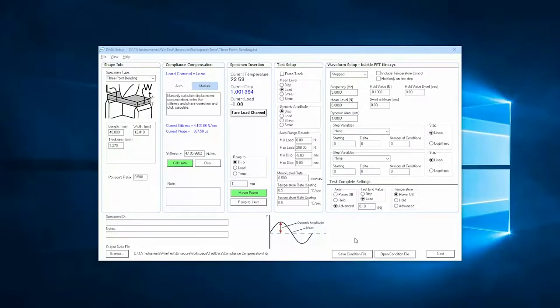The specimen insertion panel contains controls for monitoring and adjusting the system in preparation for the test.